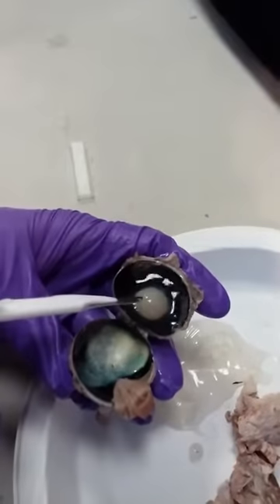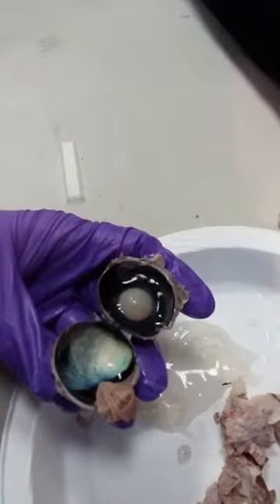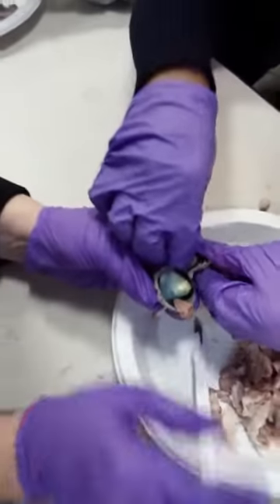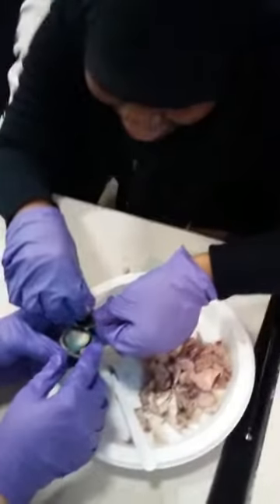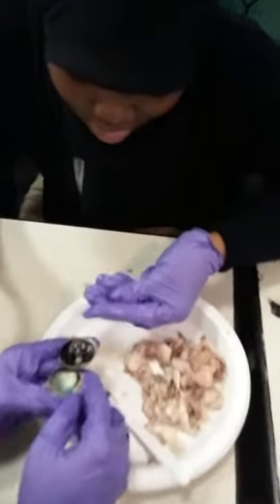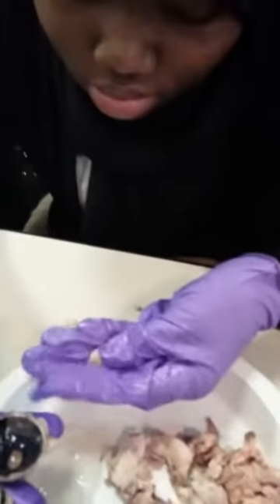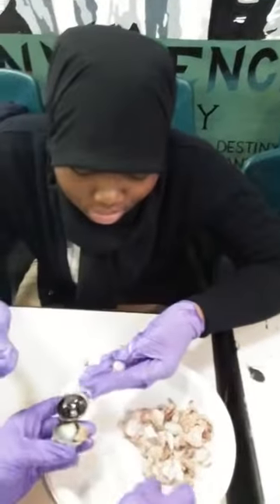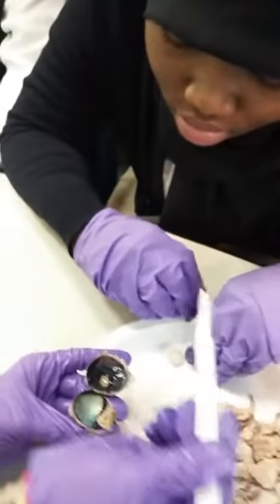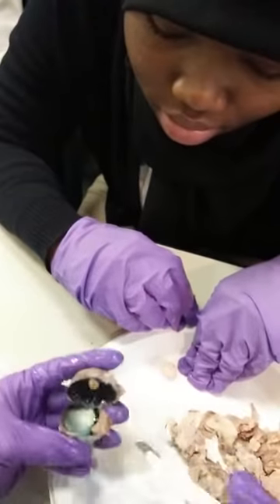Now, what I want you to do is take your finger and see if you can get that lens out. It should pop right out. Wait, it's kind of hard. Perfect. So that's the lens. Why is it so hard? It's like a glass lens in a camera. And then this hole right here is the pupil. Like you have a hole in your eye. This is the hole in its eye.